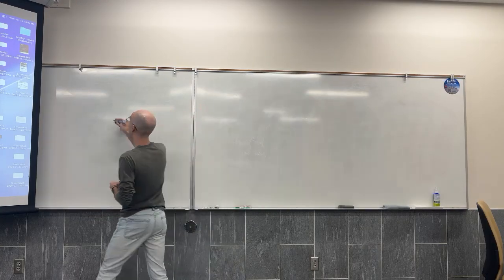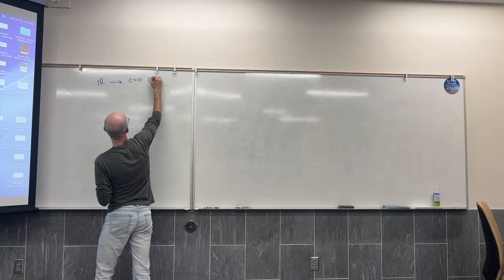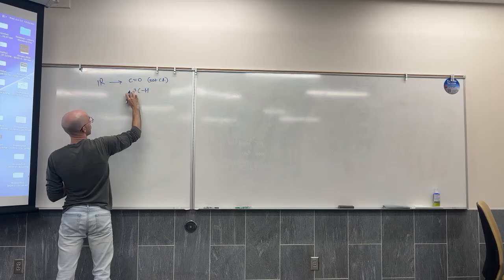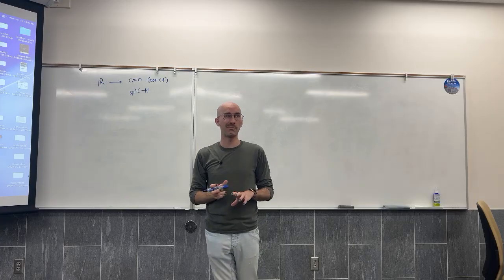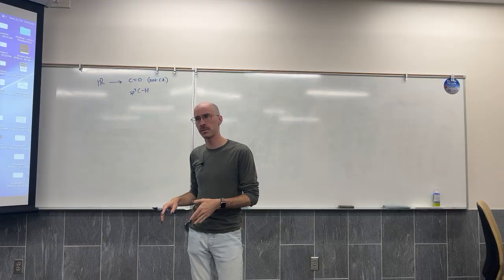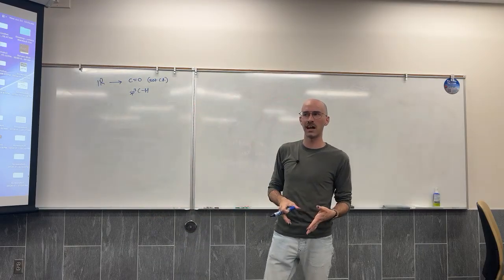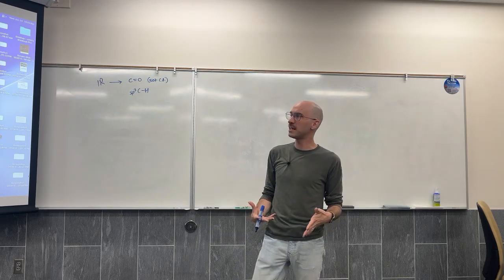We already had analyzed the IR here, and we felt with confidence that there was a CO double bond that was not from a carboxylic acid. We also felt with confidence that there was sp3 CH bonding. That was all that we were confident about, but we were questioning whether there was NH, but it was lacking some corresponding peaks, questioning if there was sp2 CH, but there was lacking some corresponding CC double bonds, questioning if there was aldehyde, because there is a corresponding CO double bond, but not a very obvious twin peaks of the CH.